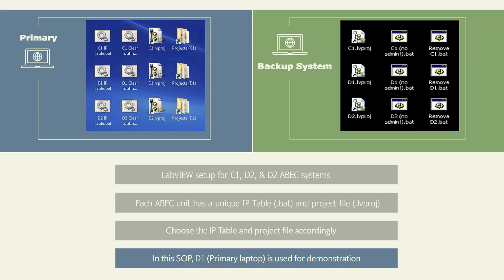Note, this LabVIEW setup is utilized for C1, D1, and D2 ABEC systems. Each ABEC unit has its unique IP table and project file. Please choose according to the ABEC system you are using. In this SOP, the ABEC 300L bioreactor in the name D1 is used to demonstrate how LabVIEW is set up.